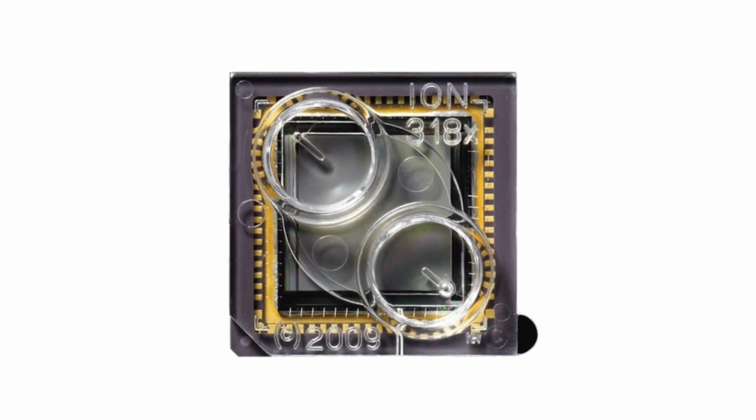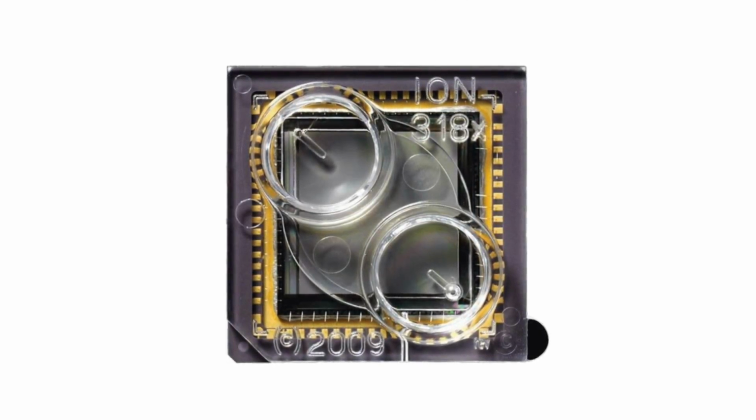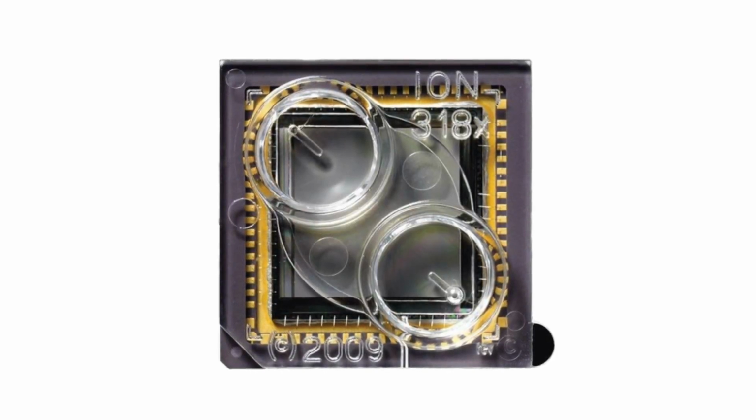About 6 months ago, we brought in two new DNA sequencers from Life Technologies, the Ion Proton and the Ion Torrent. And basically, they have a chip like this that is basically a semiconductor chip on the back side. And on the front side, it has about 165 million wells for DNA sequencing. What we can do with this now is sequence almost human-scale DNA in about 15 hours and then run that over to the Cray for data analysis and processing.